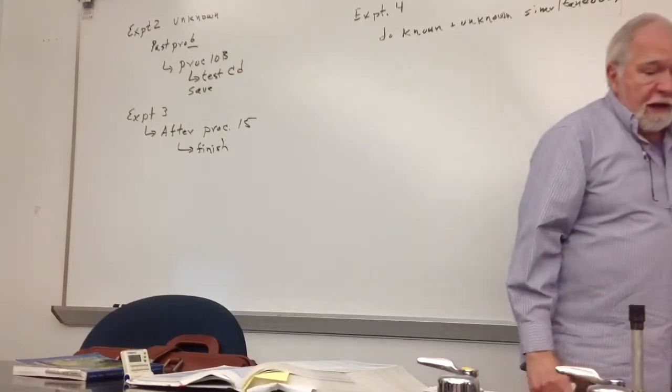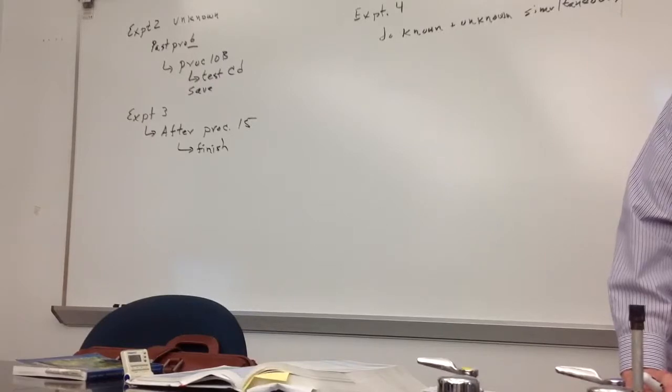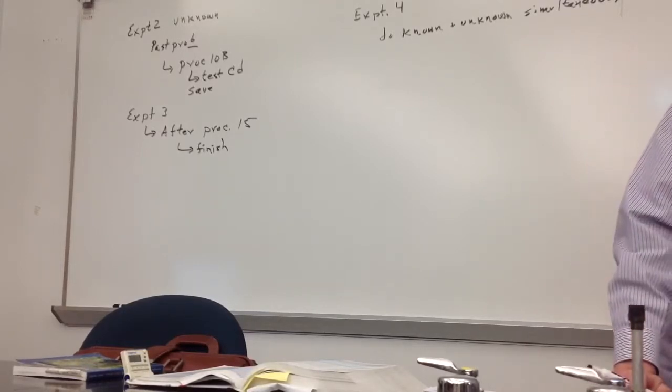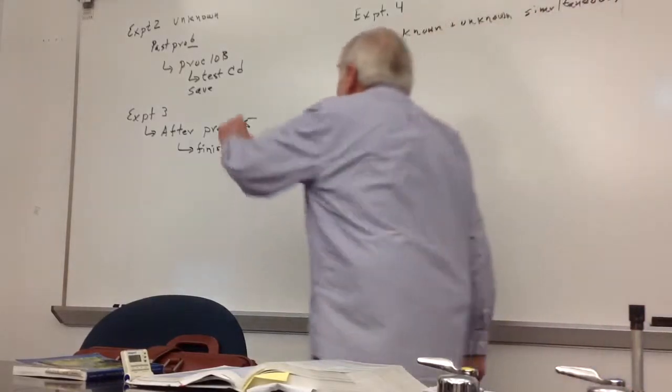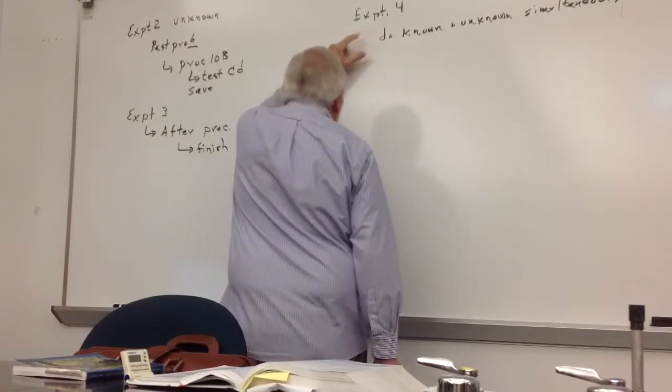Then, when we come back on Monday, we will have ammonium sulfide. We'll continue as we've been doing before. You just take up where you left off. You should be able to finish experiment 4 today, because it's a fairly quick lab. That's why I put 1 day for the known, 1 day for the unknown in the original schedule. So what we're doing now is doing them simultaneously. For people that can't do this, and you can't continue with this, this is what you'll do.